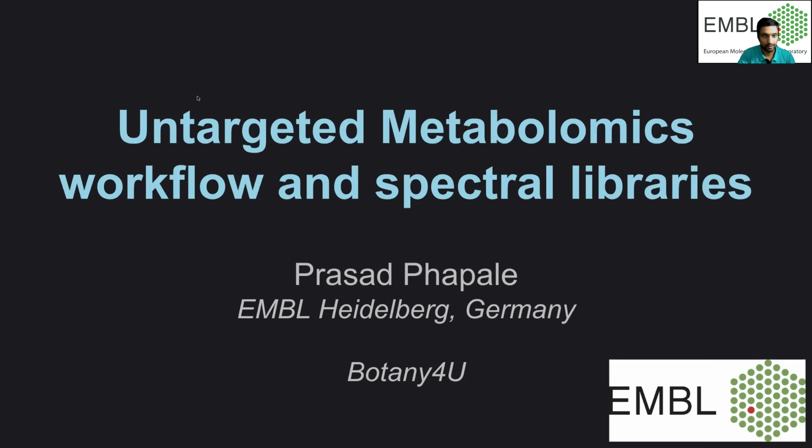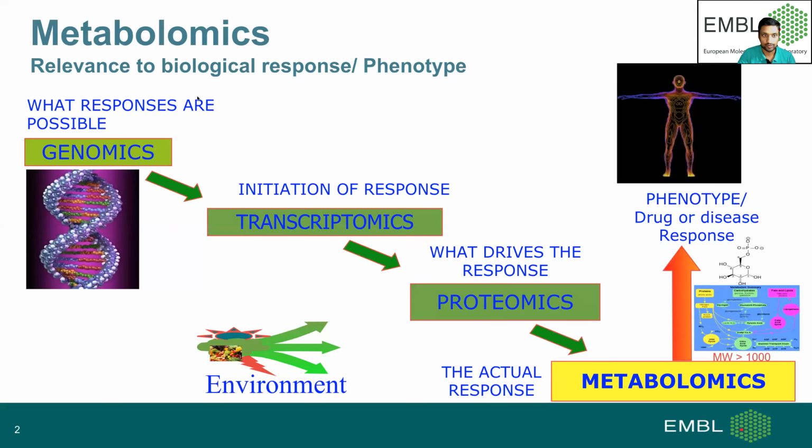And I hope that the insights, which might be a new topic for someone, will be useful. So I will start from the basics and go into much detail about how to perform the analysis and go through these workflows, particularly the untargeted metabolomics and lipidomics workflows, which are very popular, and this work we are doing in the spectral libraries. So let me start with what is metabolomics.